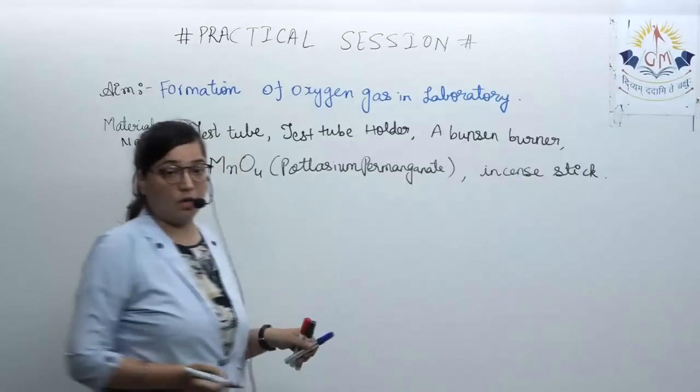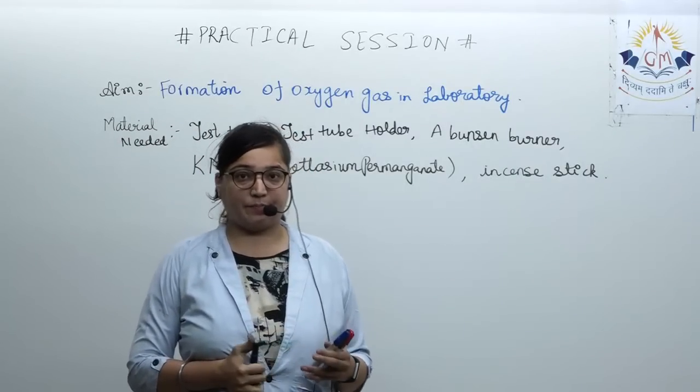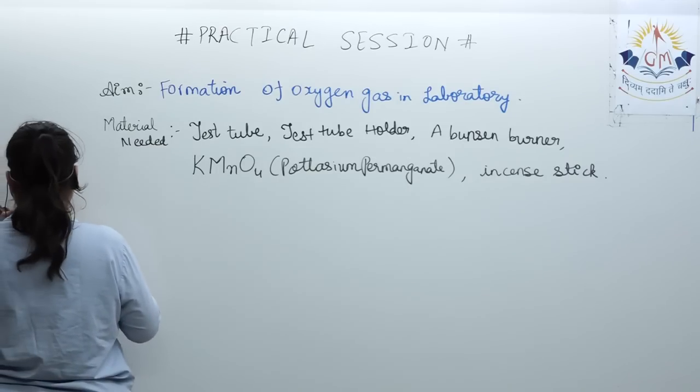How will we perform the experiment now? It's very easy. Procedure.